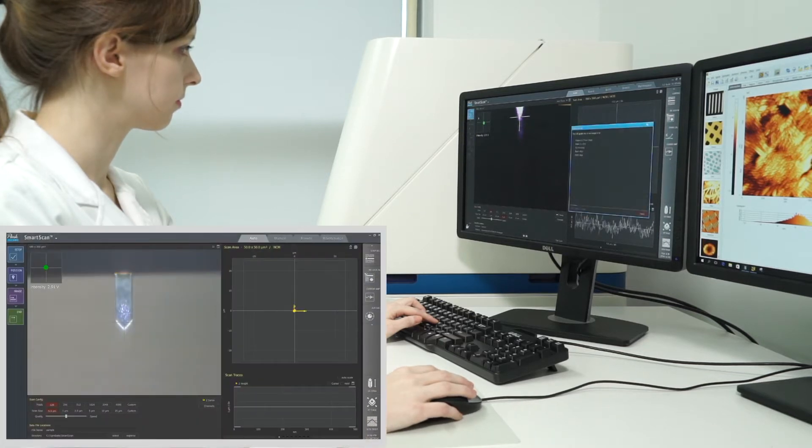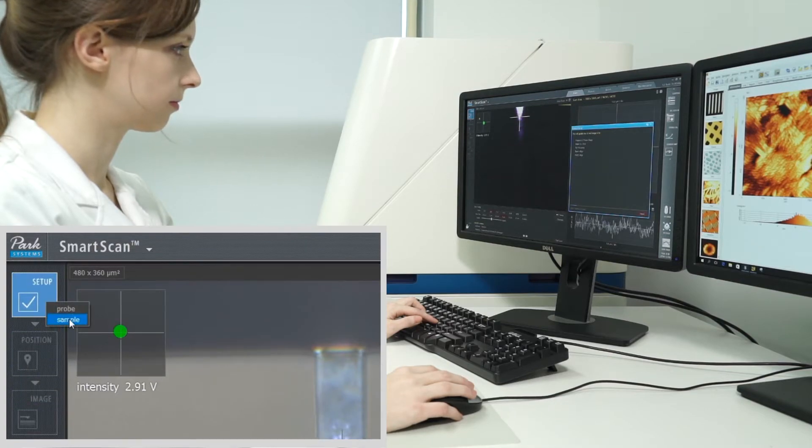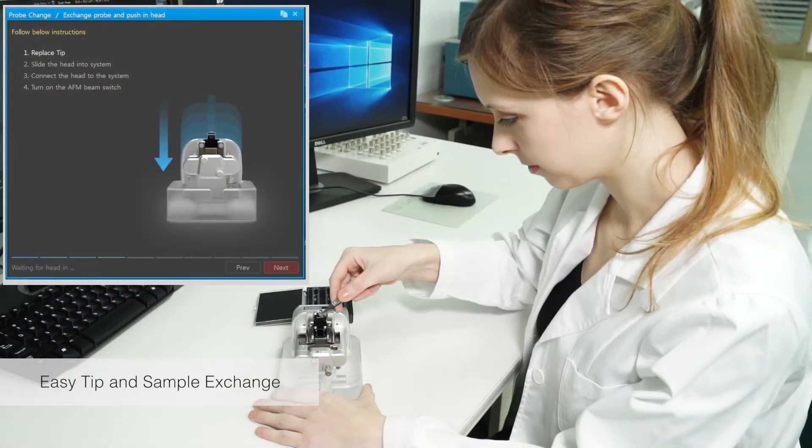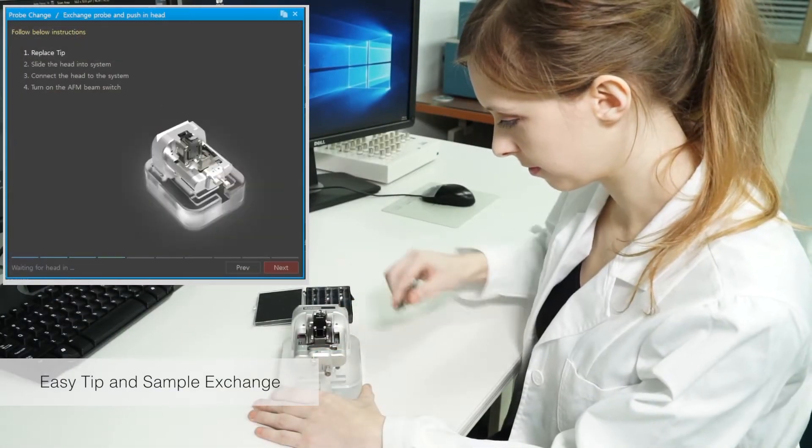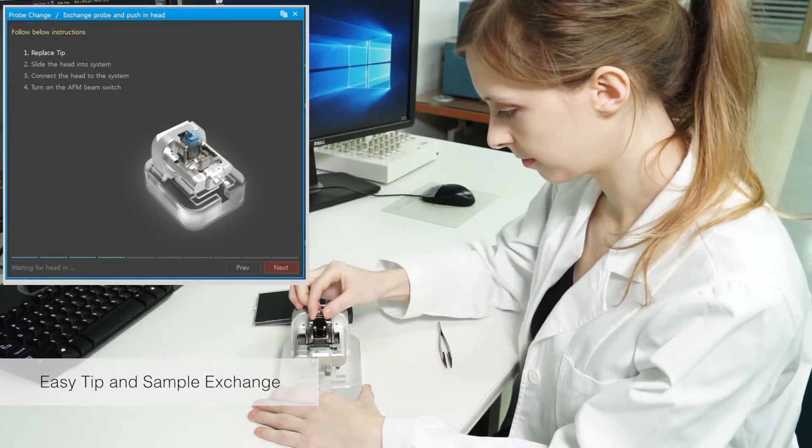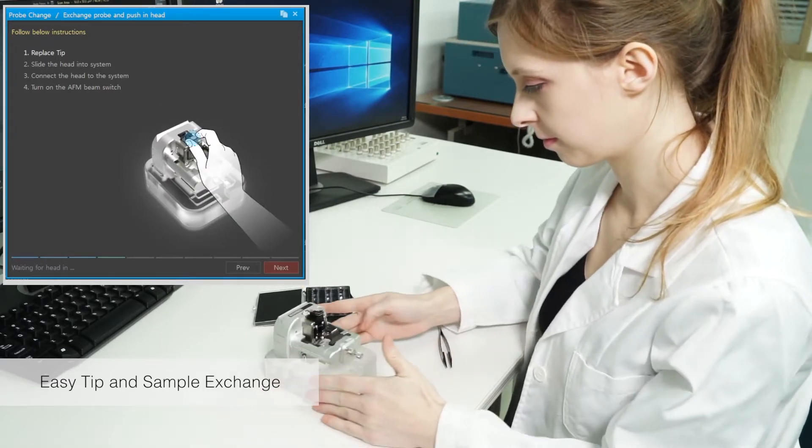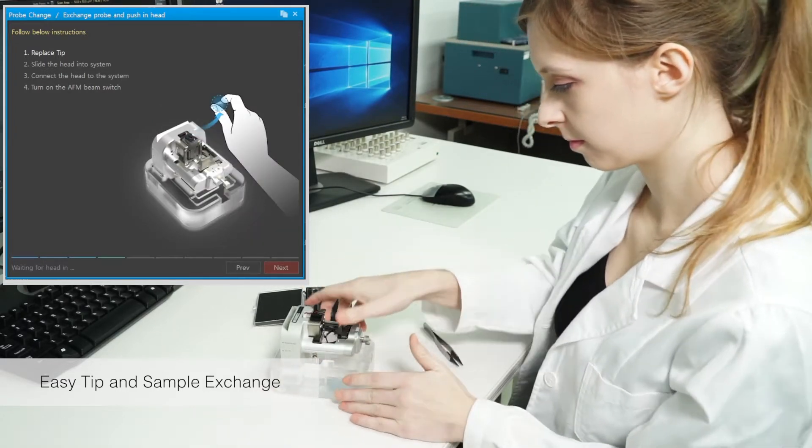First, let's start up ParkSmartScan and click on Setup. Follow the on-screen wizard's instructions to quickly complete the preparation for measuring a sample within a few minutes.